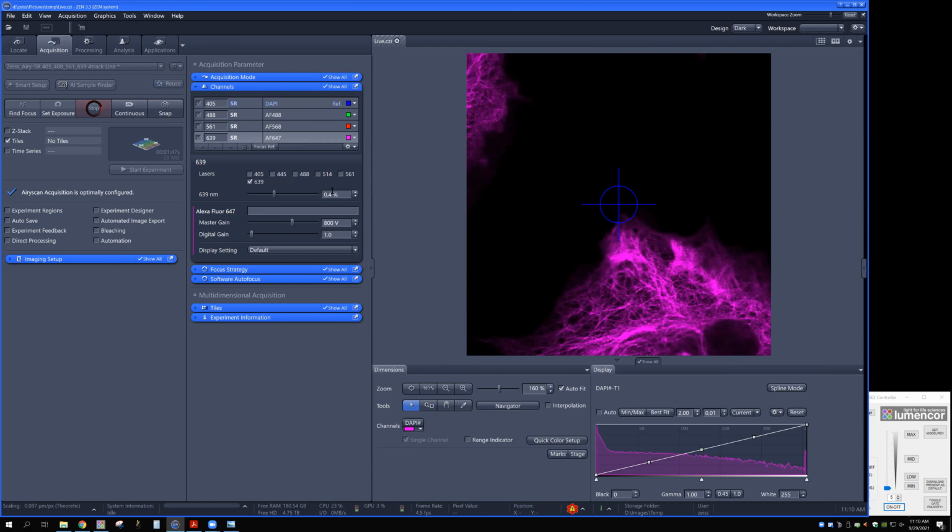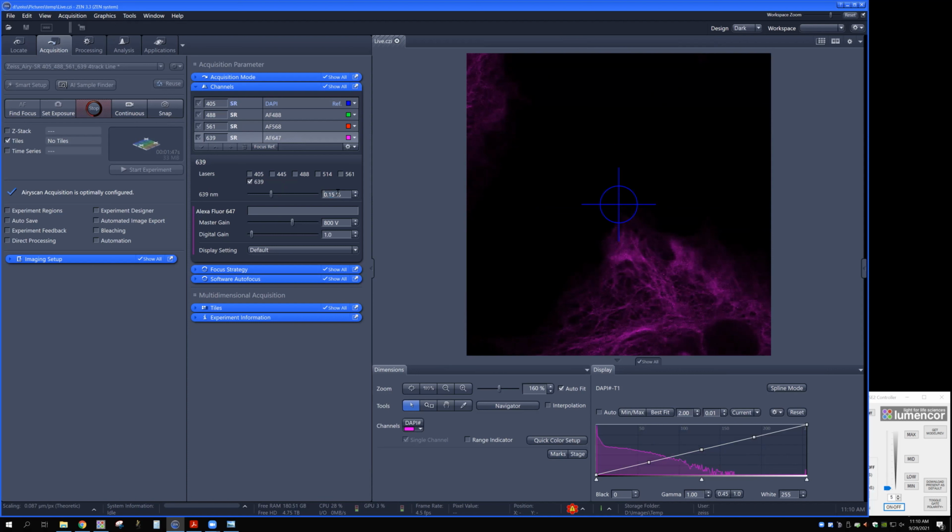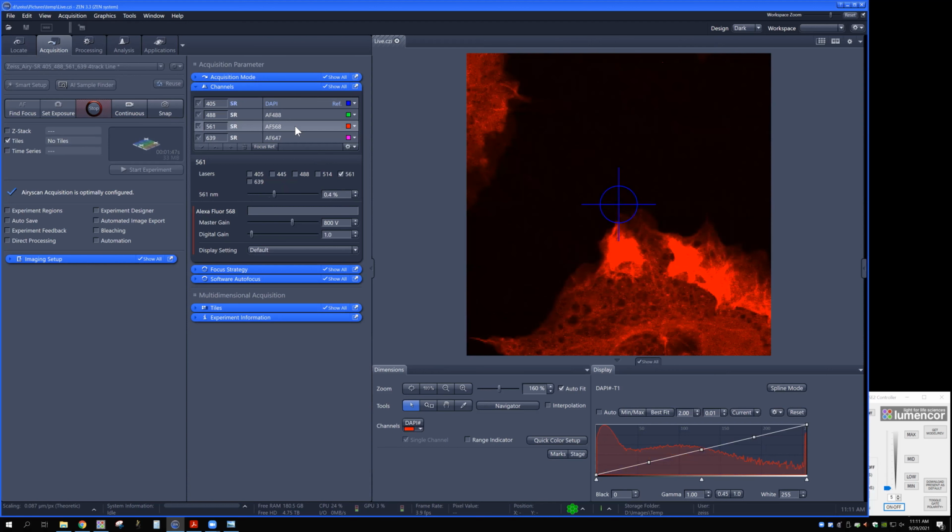Okay. Slide from August of 2019. Wow. It's doing pretty well. Nice. So I can really back off on my laser power. That's great. Let's check out our 568 here.